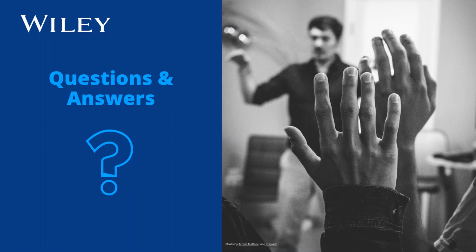Great, thank you, Liana. I think we can potentially get one more in there. Can we define our own report templates with the software? Yes, you can. Within KnowItAll, you can design a report template for your lab to use so that your reports can be standardized every time. Thank you.